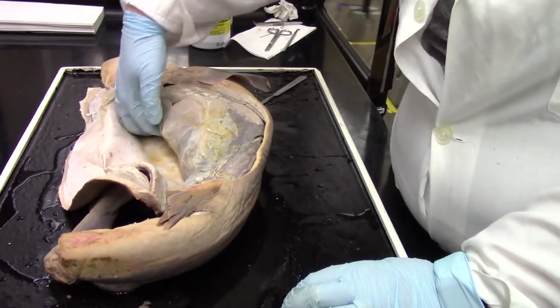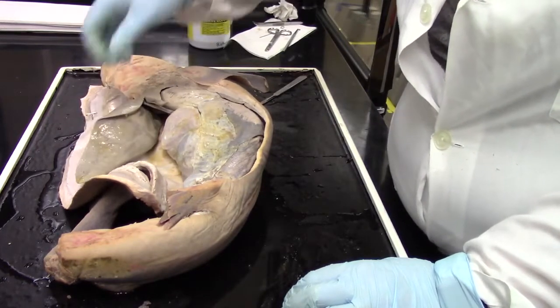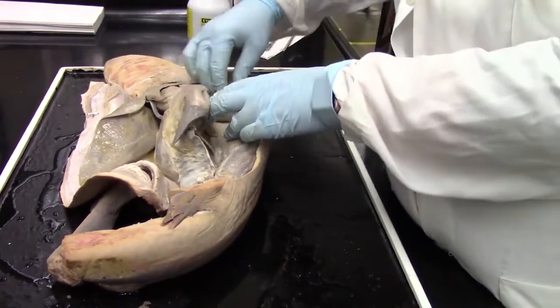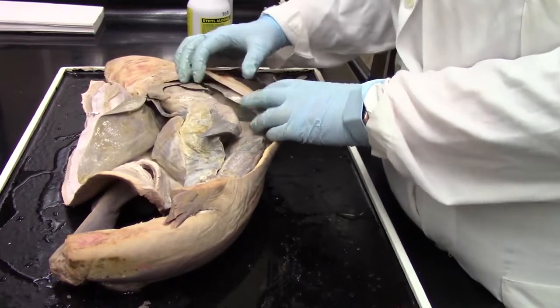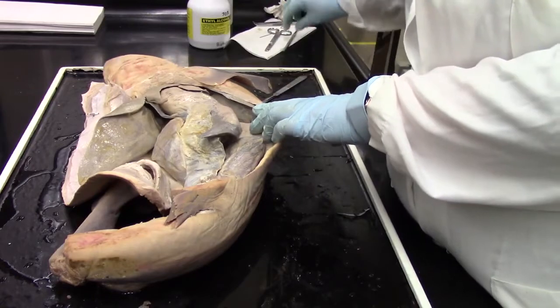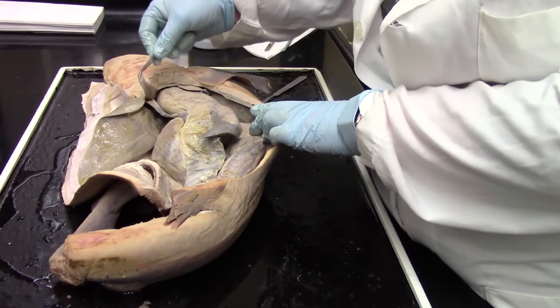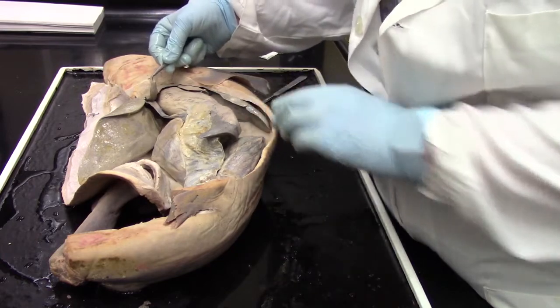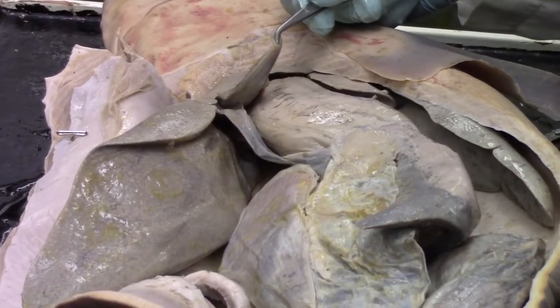Just like with the male, we've got a very large liver. So there's one lobe, second lobe here, that one we'll just leave in place, and this is our third lobe, and on the edge of that third lobe is where we can see the gallbladder. There, we should be able to see the gallbladder along there.